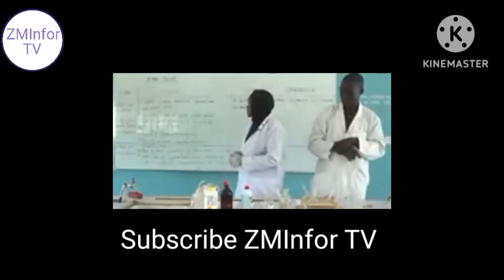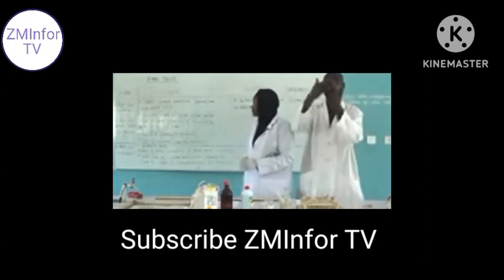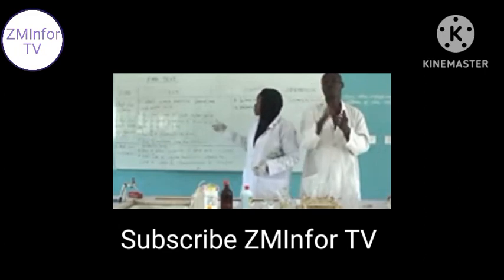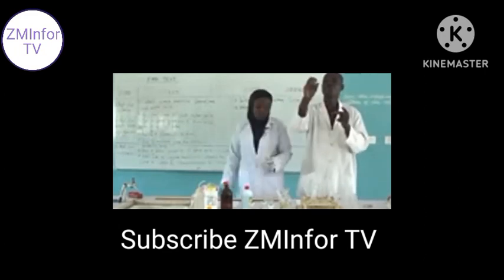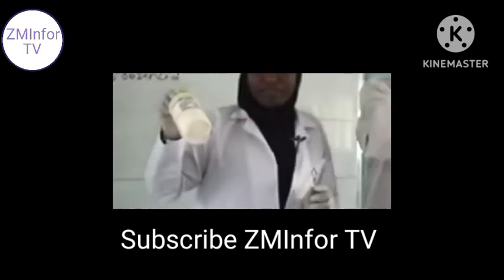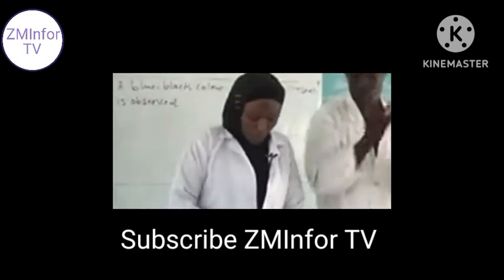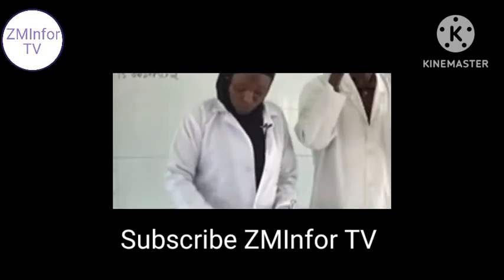Now the second test is for simple sugar. We are supposed to put a small quantity of glucose solution in a test tube. We have the test tube here and we have the glucose here, laboratory glucose. We take some few samples and we want it in solution.